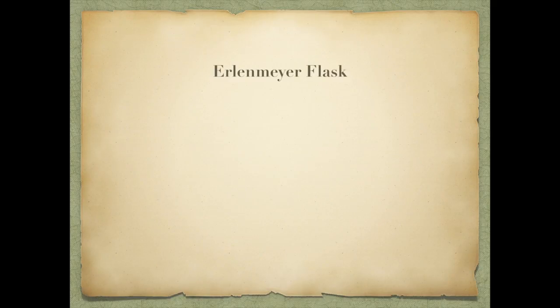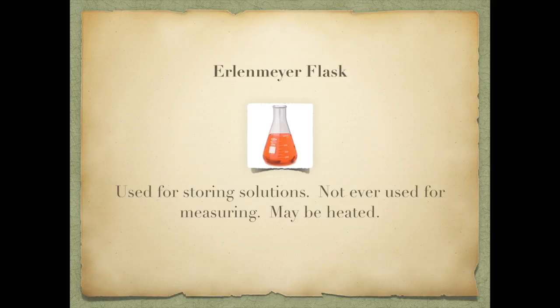The next tool is an Erlenmeyer flask. Now, an Erlenmeyer flask is used for storing solutions because it's got a very small opening at the top. It's not ever used for measuring. As you can see, it's not a precise tool, and it may be heated.